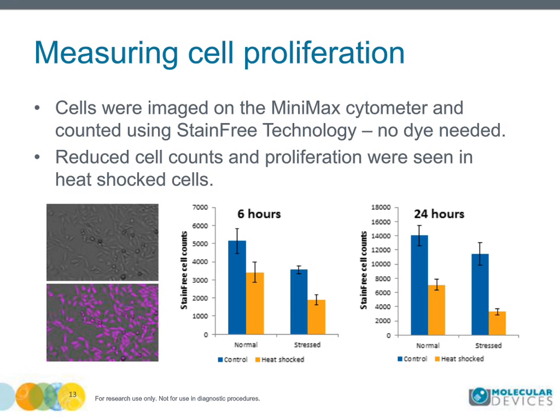And in that, you actually draw on the cells in the image using your mouse, and you indicate where the cells are, and then you indicate where the background is. And you can essentially teach the software to recognize your own cells of interest. And that works really well for a wide variety of cells. Okay, so that is the kind of analysis. We actually used a predefined setting that works really well for CHO cells in the analysis that I'm showing you here.